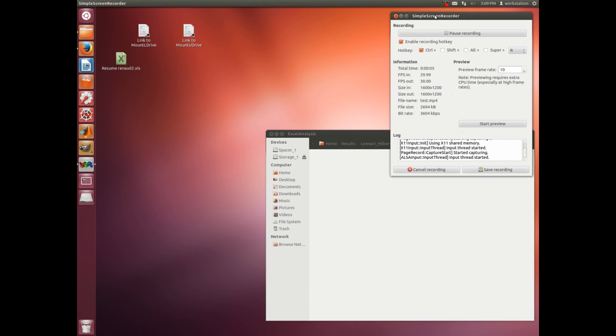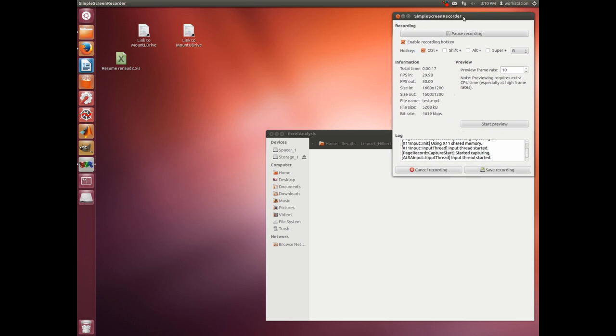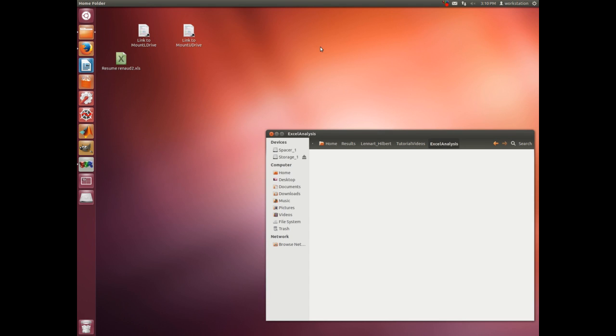So, welcome to the video tutorial for the in vitro motility analysis. This should be the first relatively simple tutorial, just how to get started and how to do a first relatively simple analysis. As a courtesy to everyone, I'd start with showing how you can download the software from the online repository if you haven't installed it yet.